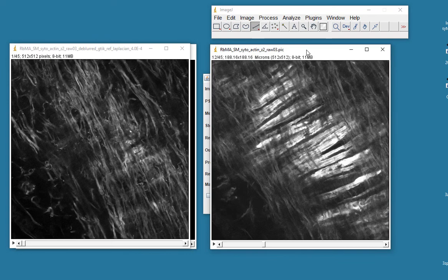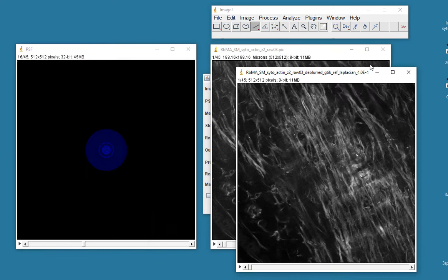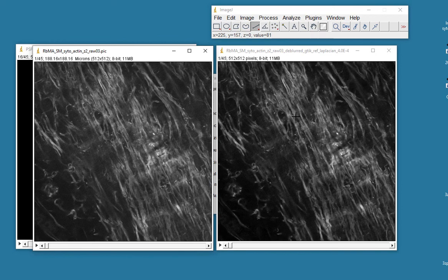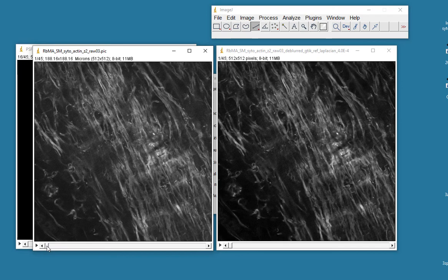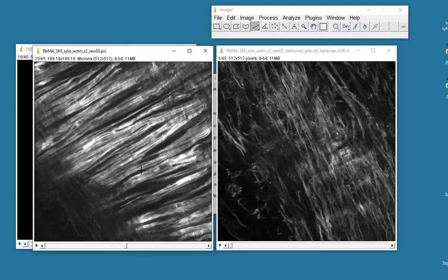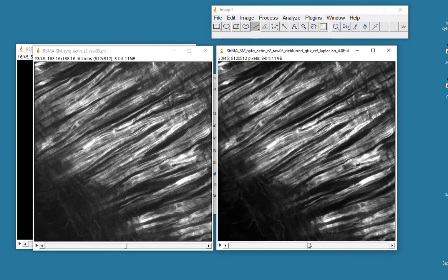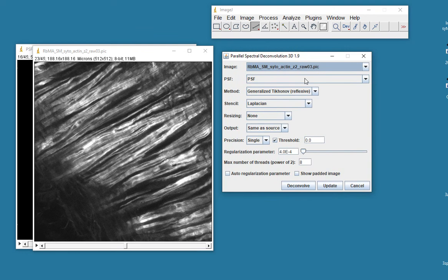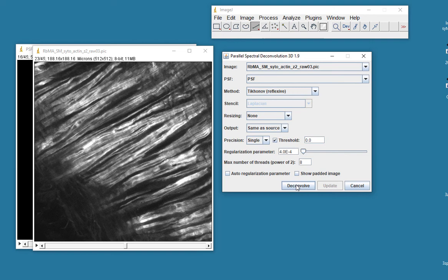Okay, so here's my result. Now, the best way to compare is to look at the same slice. So, let me put my original on this side. My deconvolve on this side. Okay, you see that in the first slice, certainly the deconvolve is a bit darker. Is it a bit clearer? Let me zoom through to, let's see, yeah, slice 23. If we go to slice 23 here. Is it any better? Mmm, slightly better, I would say. Let me try a different one. Oops, didn't mean to do that. We'll try this Tikhonov reflexive. Okay, and a regularization. Let's see with that. Yeah, let's try this.